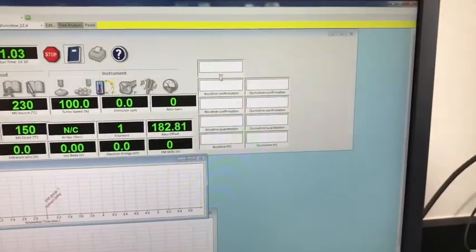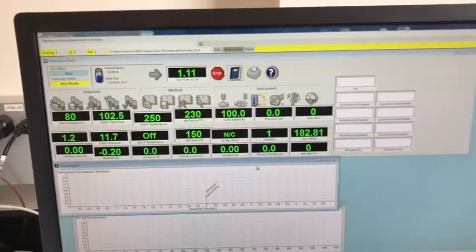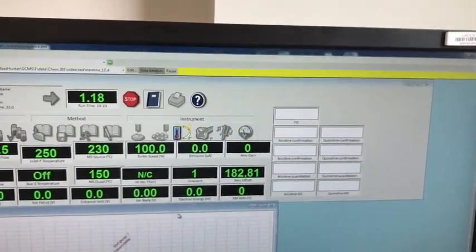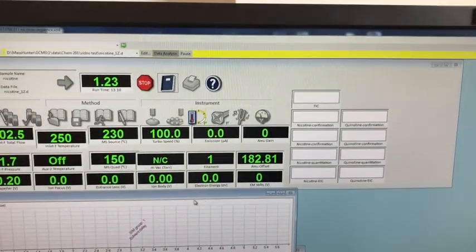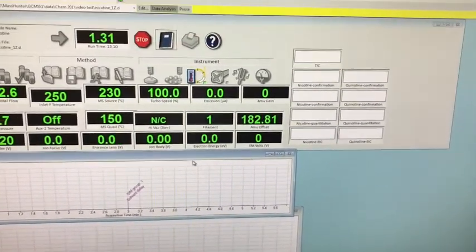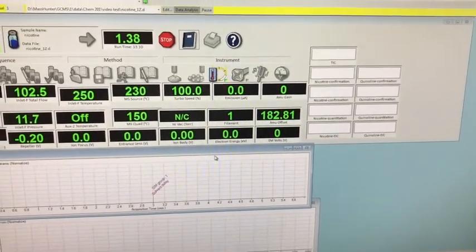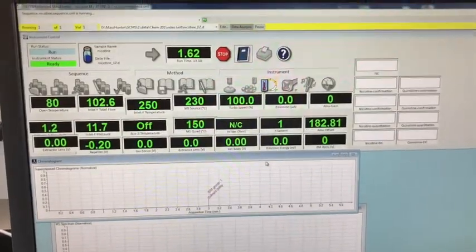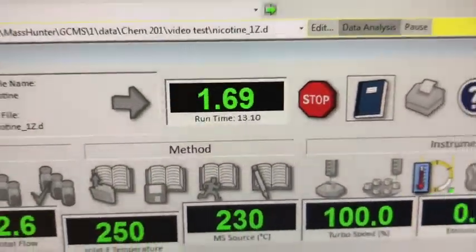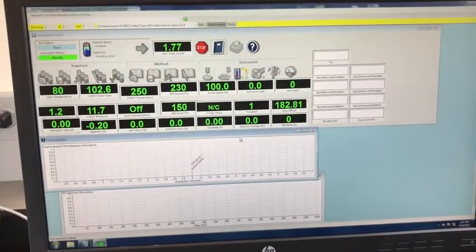If you notice, we have a bunch of different small boxes. Each of those boxes is for a different mass or m/z value which will confirm nicotine or quinoline. That's all in the research paper provided to you, and I can explain that during lecture as well. The total run time for this experiment is around 13 minutes. Then we just wait to see the peaks coming out for quinoline and nicotine.